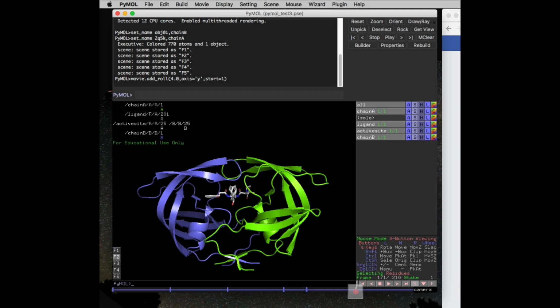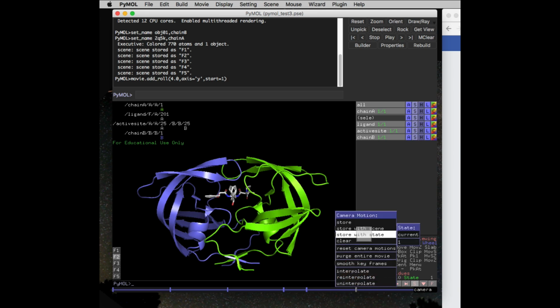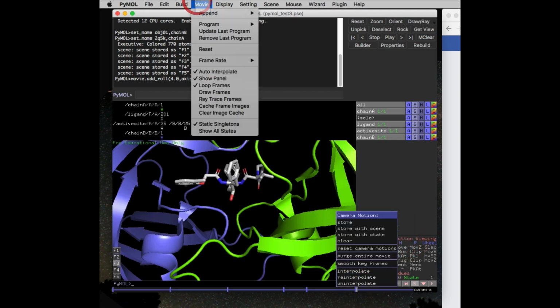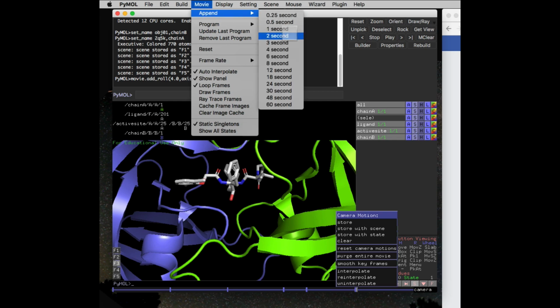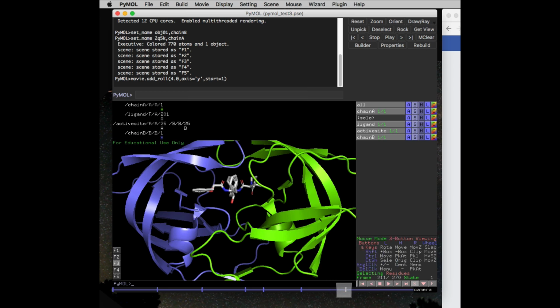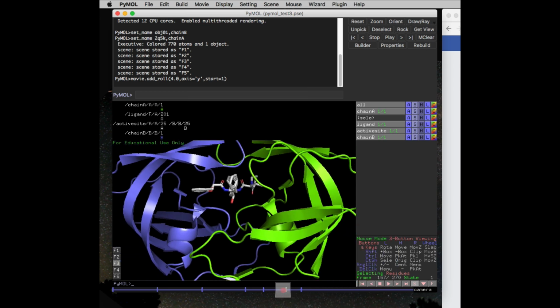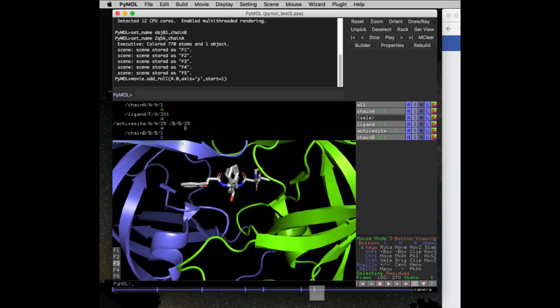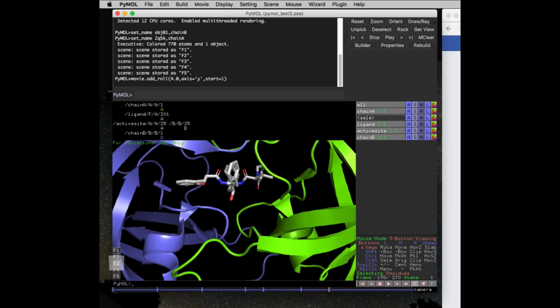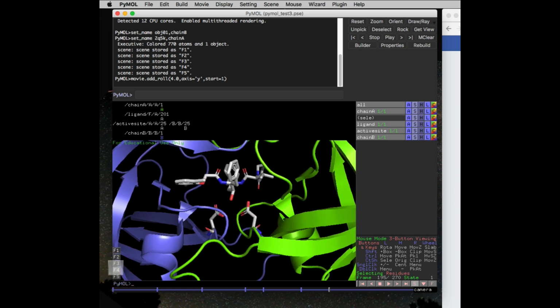All right, so we're back there. We'll pull back our scrubber a little bit, right click, Store with Scene 3, and in this case that's a zoom in, and we'll immediately append 2 seconds to that. So now all we've done is zoom in here, right? We're zooming in, and then we're back. Okay, so somewhere there we'll switch to keyframe 4, I believe.